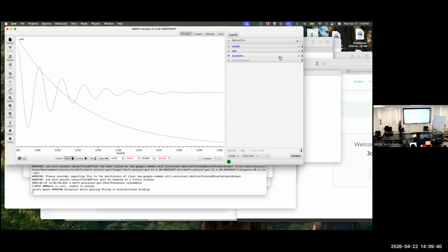I'm going into the theory here, but basically, your signal starts at time zero. There is no signal before you've actually done the pulse. And it turns out if you work out this theory of signal processing, with a complex signal, if you don't zero fill once, you effectively lose half the information in the signal. So you should always zero fill at least once. We could work through a little playing around with the data and reproduce exactly how that works. But in today's talk, I won't go into that.